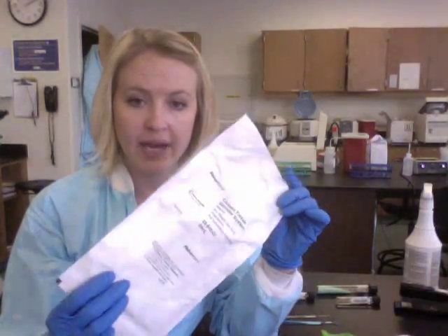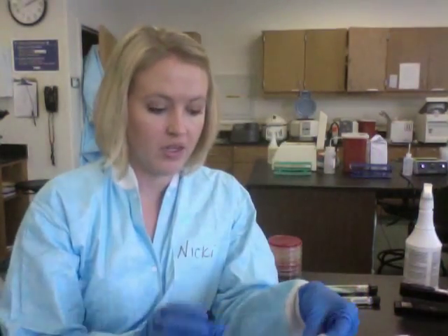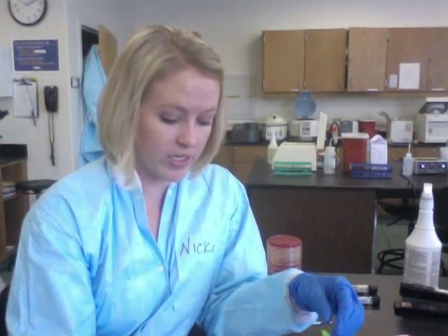I'm going to show you how to set up a tissue with the tissue grinder. It comes in a package like this — it is a sterile, enclosed package. You're going to get your tissue grinder and your tissue ready under the hood. You may need a scalpel and sterile forceps. You're going to have your gloves and lab coat on while working under the hood.